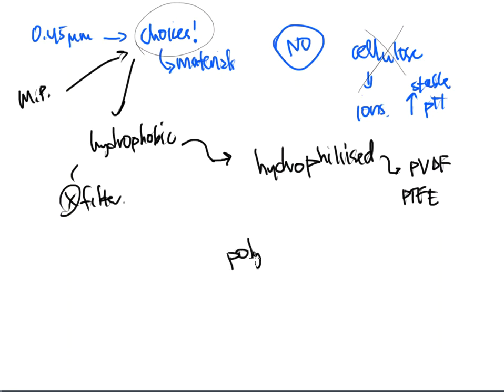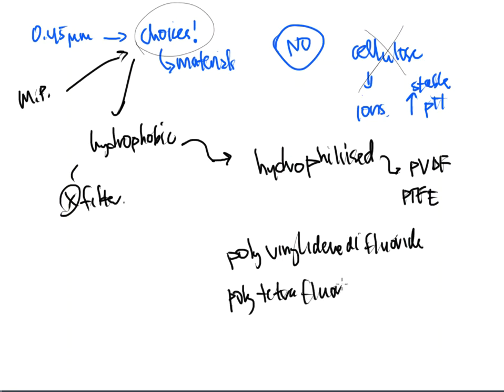PVDF is going to stand for polyvinylidene difluoride, and the PTFE is polytetrafluoroethylene. That's what those abbreviations stand for. They are very common materials in membrane filters.